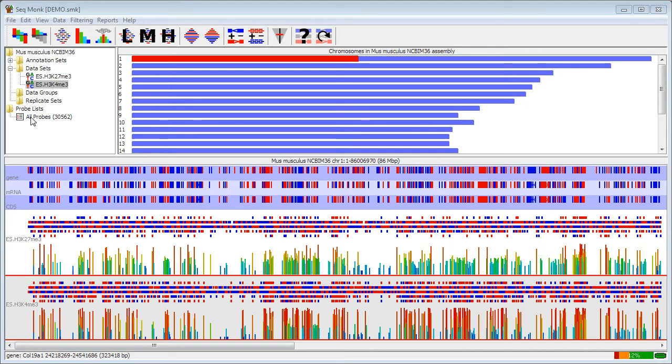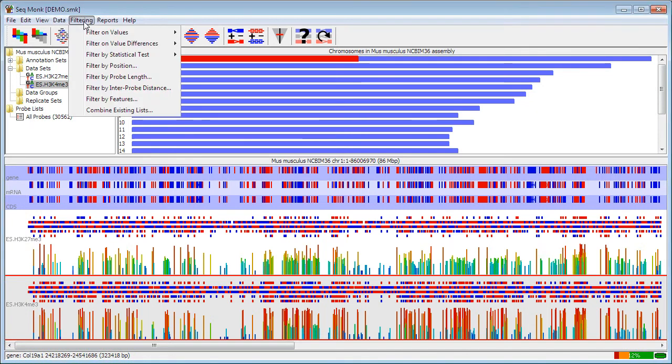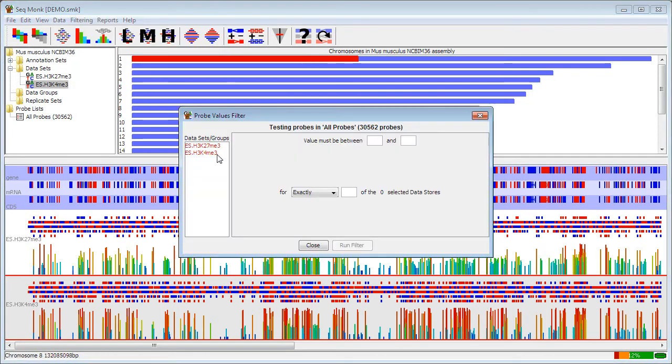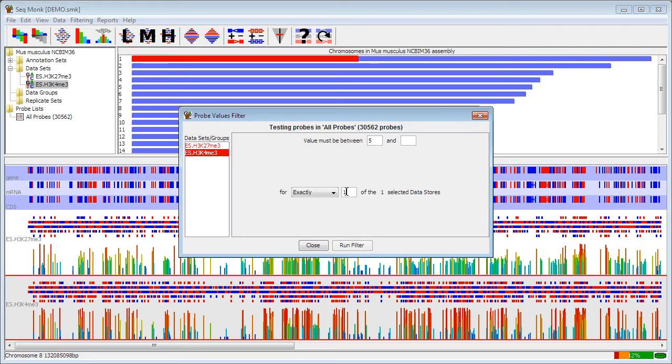There are a series of filters that you can apply, all of which are found under the filtering menu. To show a simple example, I'm going to do a simple filter on values for each probe individually. In this case, I'm going to select my K4 data set here, and say that my current quantitation value would have to be greater than 5 for the one data set that I've selected.